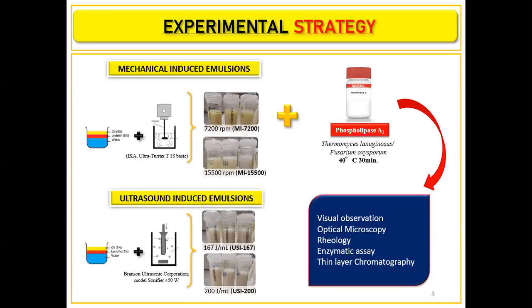After each of these emulsions was elaborated, we added phospholipase A1 and incubated at 40 degrees Celsius. And before, during, and after the enzymatic reaction, we evaluated our samples using different techniques like simple visual observation, optical microscopy, rheology tests, enzymatic assays, and thin layer chromatography.